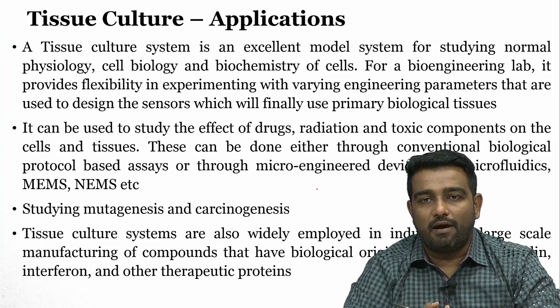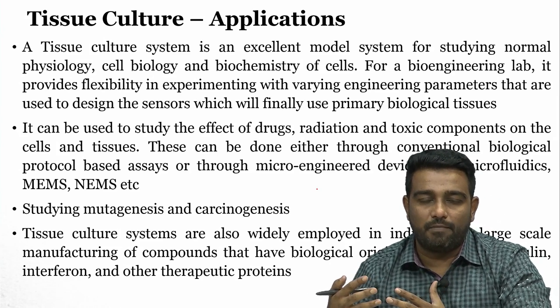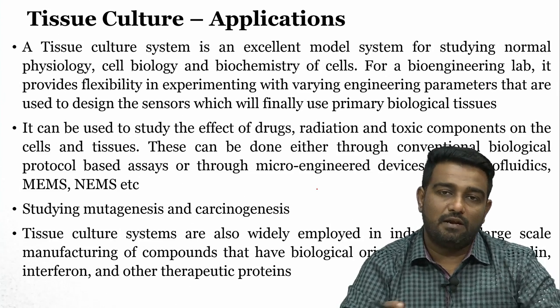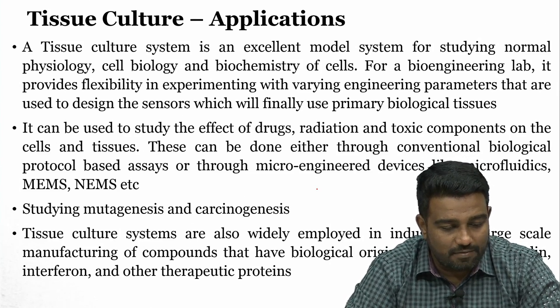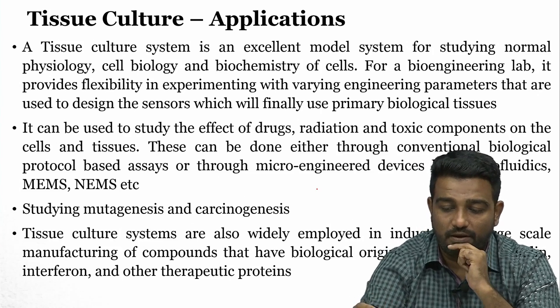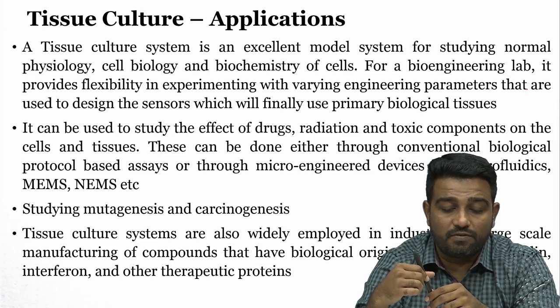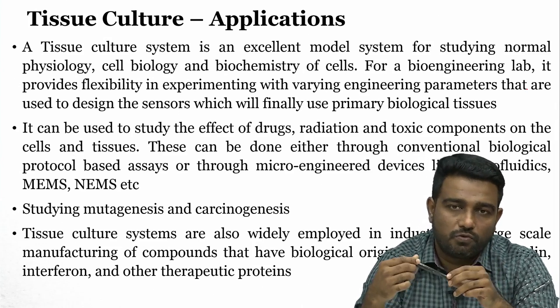That is my point about a bioengineering laboratory, where we study different projects with different problems, and there is interdisciplinary research. It provides flexibility in experimenting with the varying engineering parameters I just discussed, which are used to design the sensors that will finally be used for primary biological tissues.